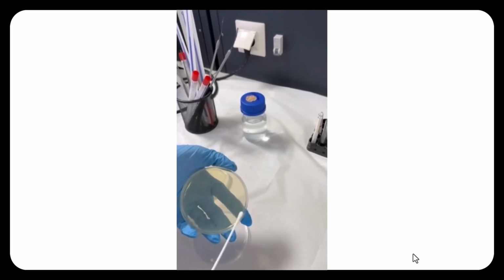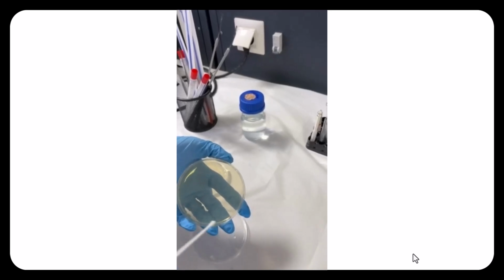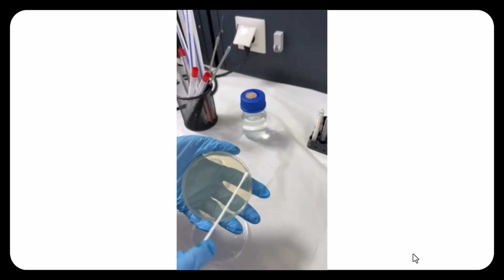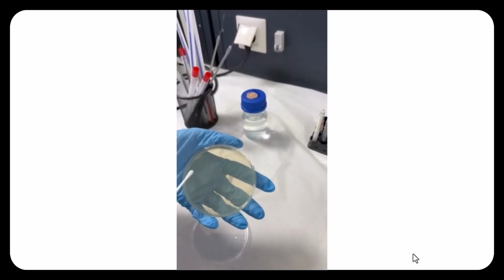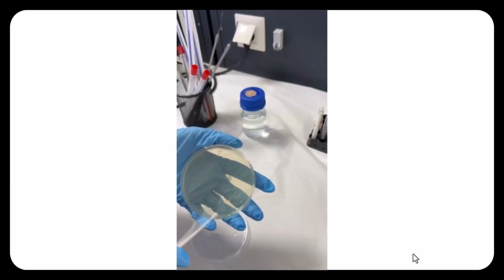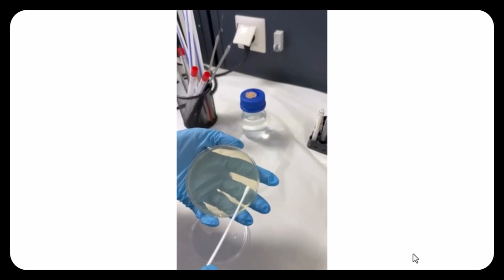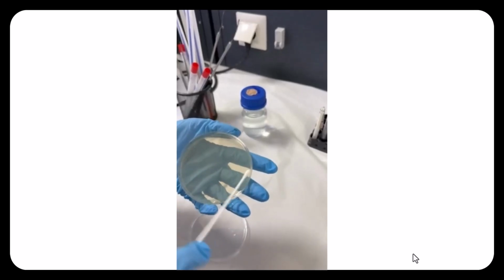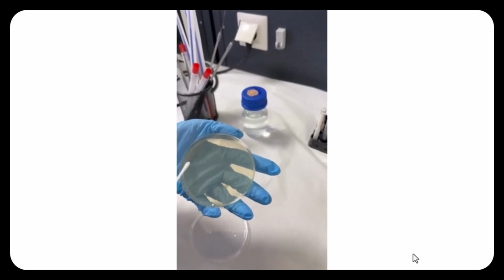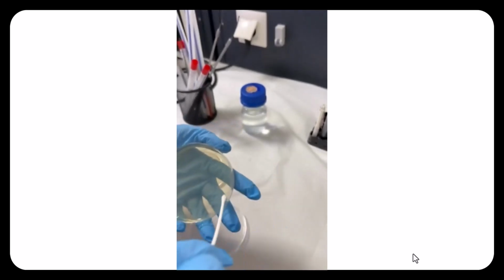Spread the bacteria evenly over all the agar plate. And all the work is near the burner because the sterilization is very important.